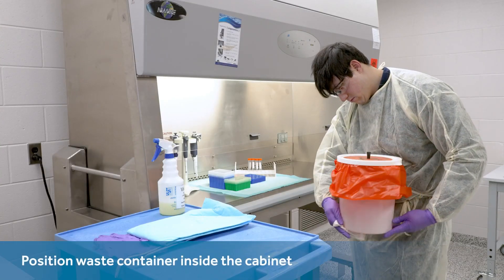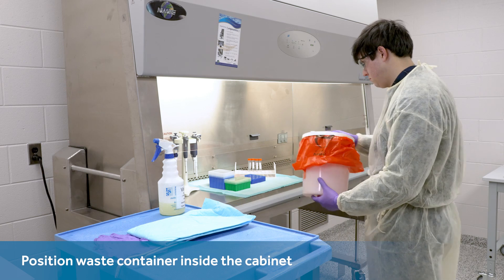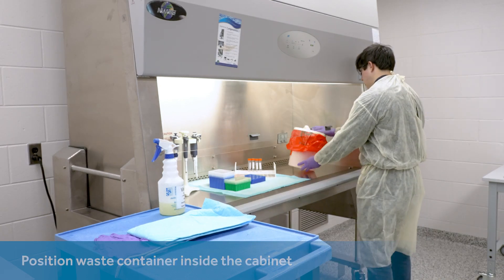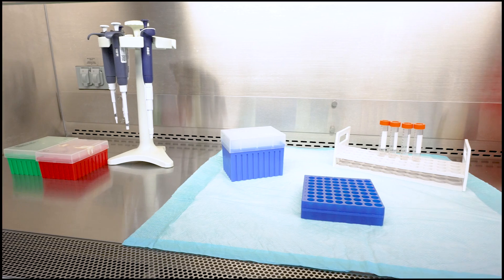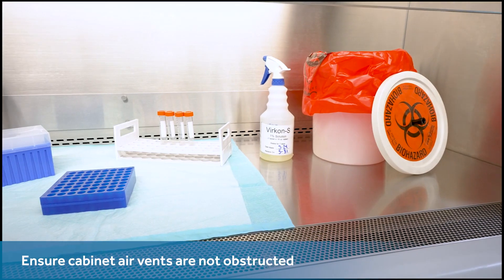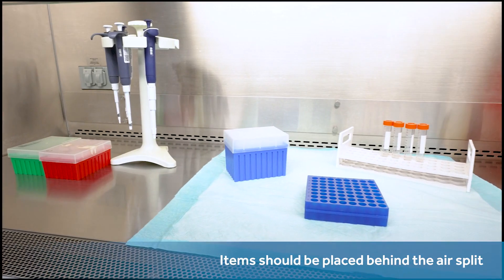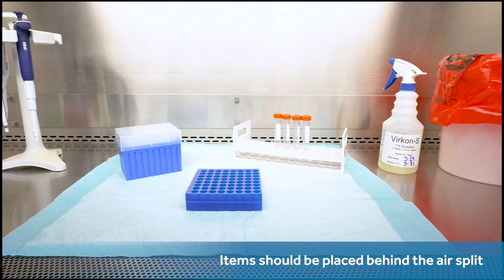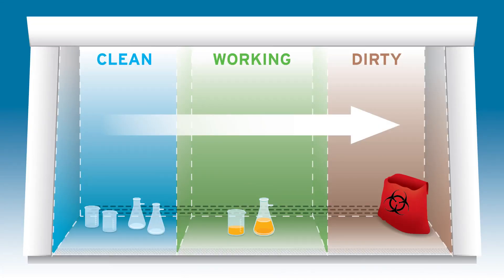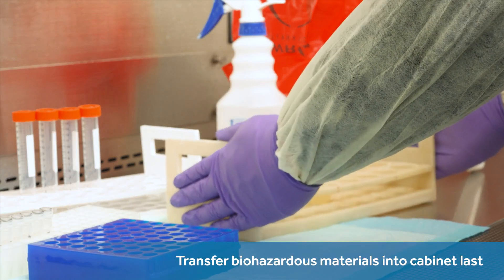Biosafety experts and guidelines discuss many potential strategies to manage waste, but they commonly recommend prepositioning whatever will enclose that waste inside of the cabinet ahead of time, to make the waste container accessible without reaching outward across the airflow. Guidelines commonly warn about ensuring air vents are not obstructed, particularly when choosing the position of the mat or other objects. The suggested work surface position for items is behind the air split, but with distance between the items and both the forward and posterior air vents. Biosafety guidelines suggest creating a lateral buffer between items that are clean and potentially contaminated, and one recommendation is to make the biohazard itself the final transfer into the biosafety cabinet.